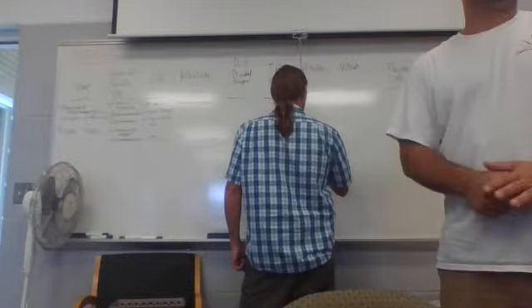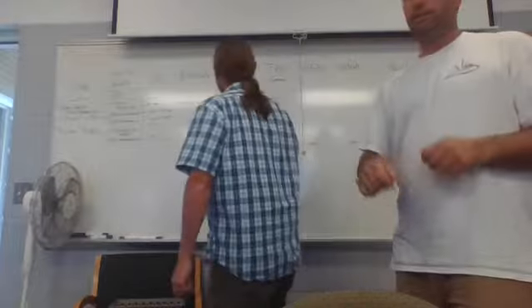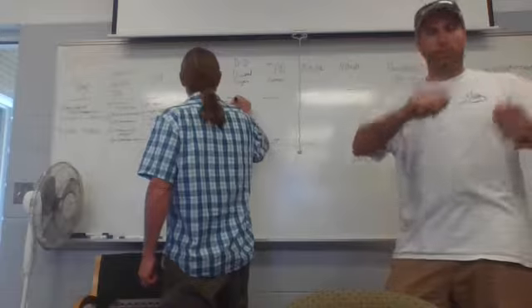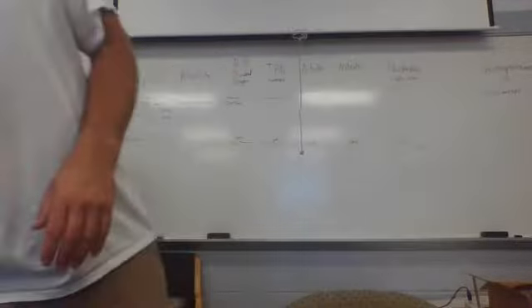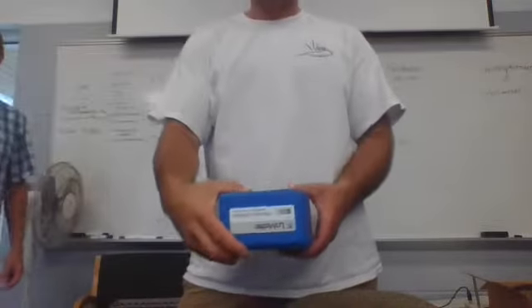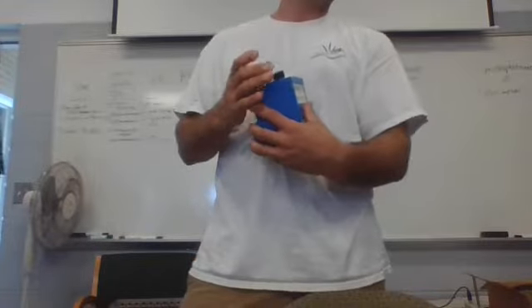Dissolved oxygen. Titration and a meter. Okay, so the Winkler titration, right? I don't know if any of you have done that in high school chemistry labs or whatever. You get your reagents that you add a little bit at a time, and there's a whole calculation involved. There is again the little kit like this, the dissolved oxygen kit, which has a set of reagents that you add at different steps, and following the instructions is very important in all these tests.